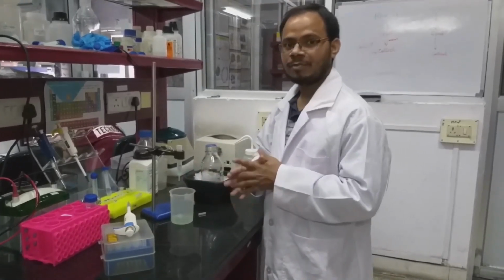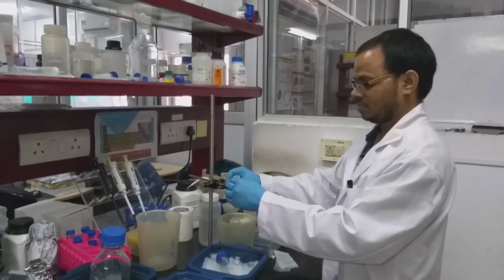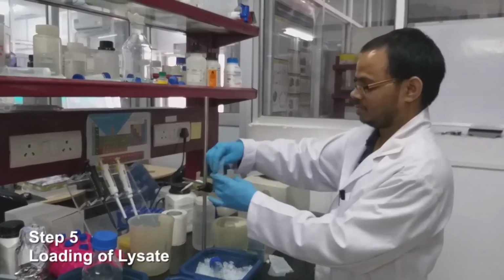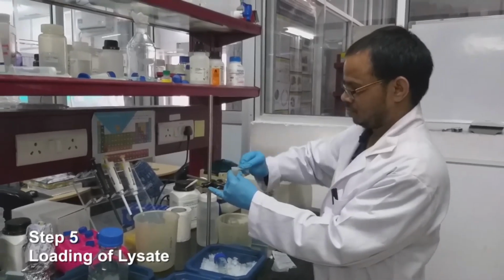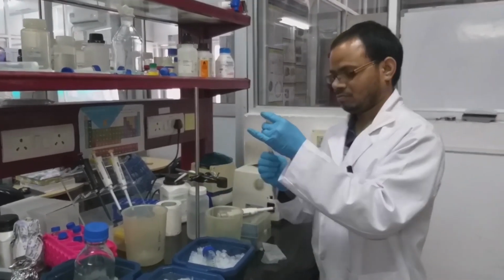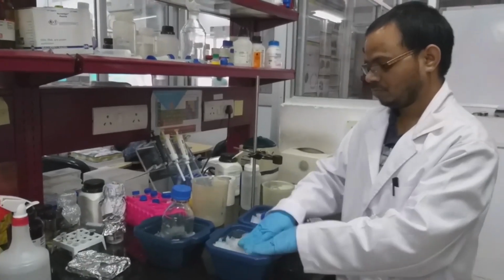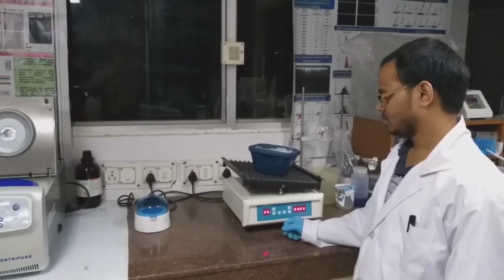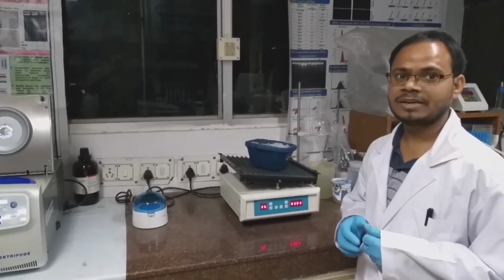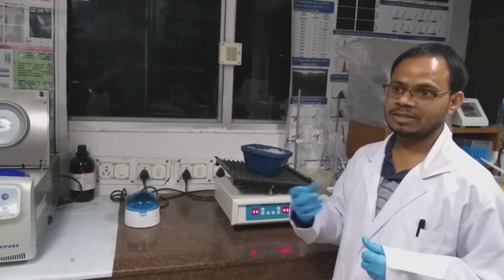So after equilibration, next step we will load the lysate and then incubate for binding. This is paraffin film. I am going to close it with the paraffin film. I'm going to keep it here. Once column packing is over, we kept it in ice and we'll keep it in this condition for at least 2 hours for binding, so that the His-tagged protein will bind to the nickel NTA, and in further steps we will elute the protein.